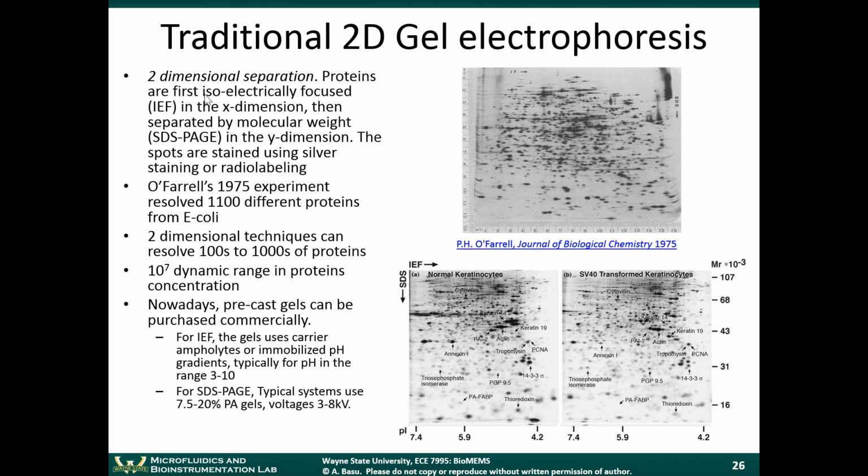If you do electrophoresis, you'll get a series of peaks on a chromatogram, right? But you can only fit a certain number of peaks on there. If you think about this another way, let's say you were to try to separate out all the proteins in a blood sample. Let's say there's 15,000 proteins in there. There's definitely going to be some proteins that have the same size and charge, or similar size and charge. So those proteins will come out together. They'll co-elute, so you won't be able to analyze them and isolate them separately.